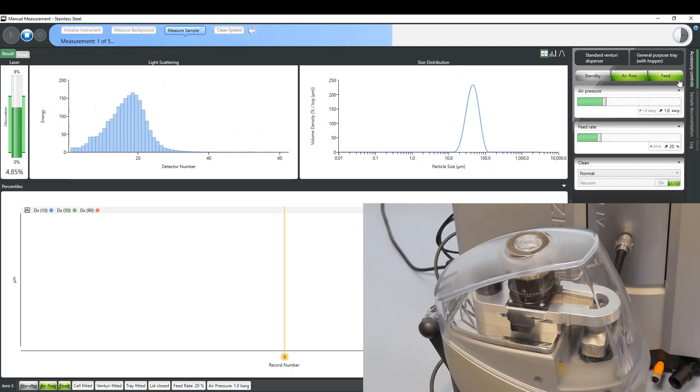Metal powders are generally quite free flowing, so an optimal feed, when the obscuration stays in range, is rather quick to achieve. The feed rate can be adjusted while here in manual mode if more control is needed though.